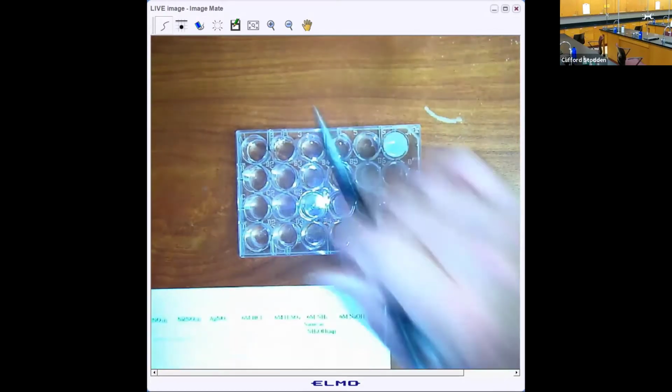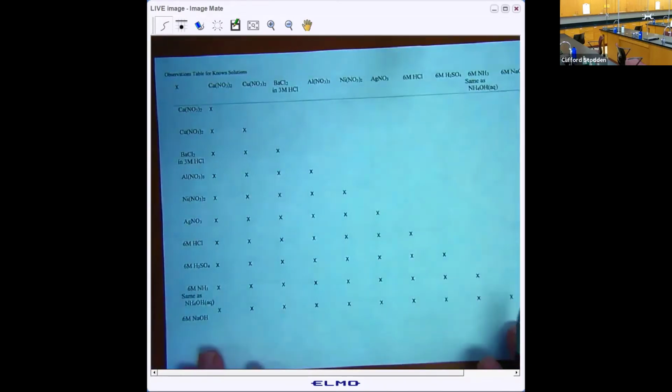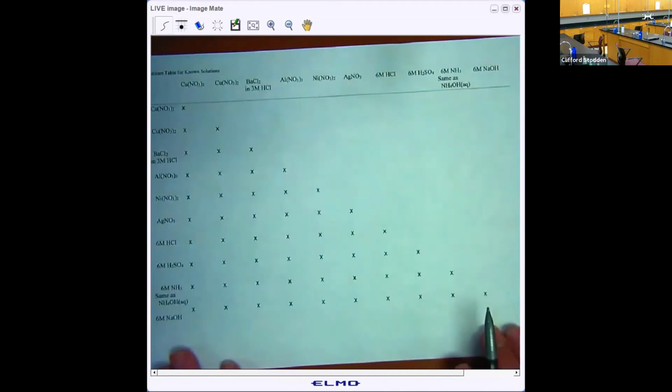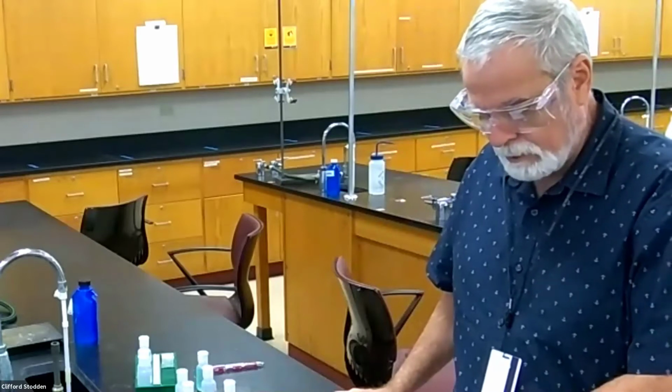So in that particular box on my grid here, that would be the first one that I'm coming across where I would put a P in. But anyway, you guys can put a P there, and it would be a white precipitate. So you could put white and then the capital P. Reaction. Now we go down to the copper.